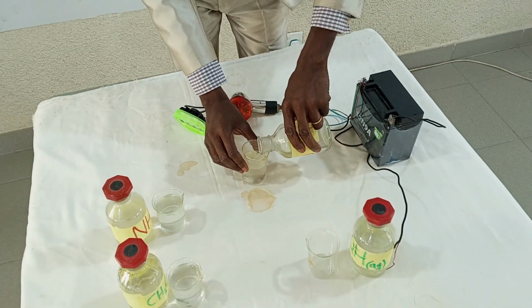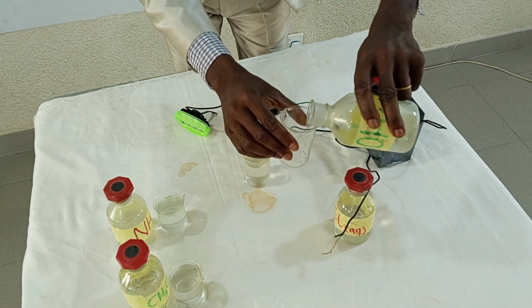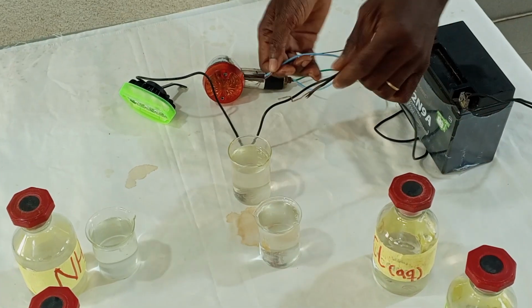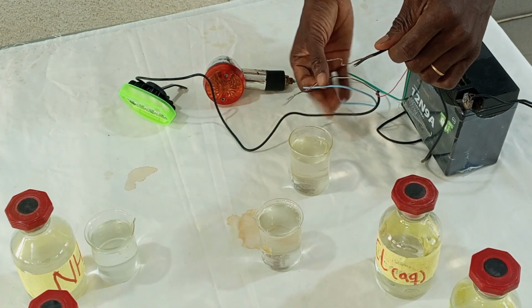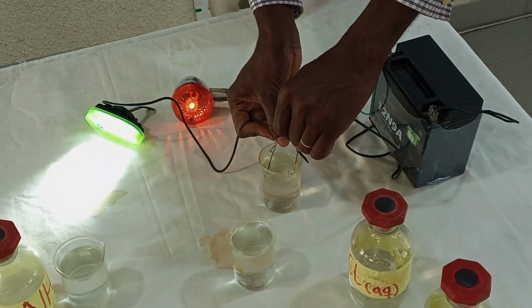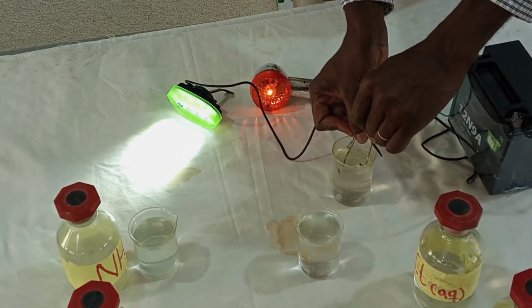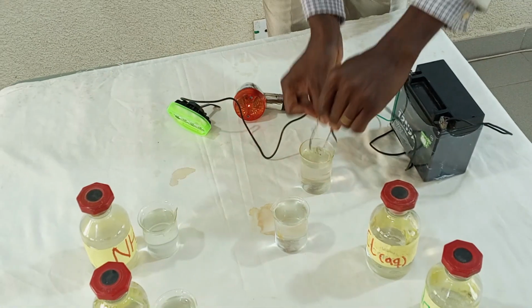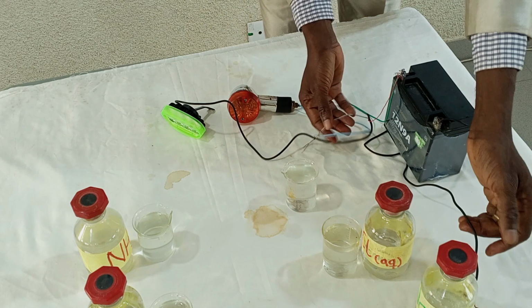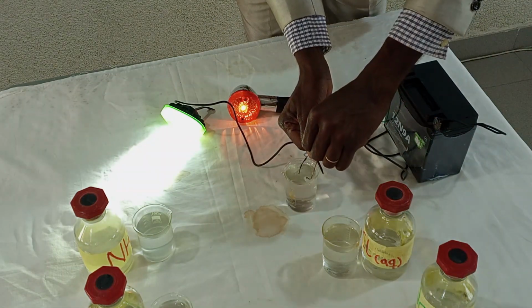I'm pouring HCl solution into my beaker, dilute, of course, and sodium hydroxide, dilute, into my beaker. Now let's see. We'll start with the HCl. You see, when you dip it into the HCl solution, the lamp produces light. Now let's demonstrate with the sodium hydroxide too. The same thing happens with sodium hydroxide.